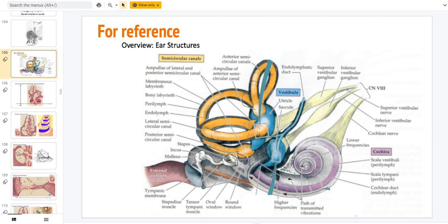This is a picture of the 3D structure of the inner ear and we're going to spend most of the time of this video looking at one particular virtual microscopy slide. I would spend most of the time on the cochlea since that's where most of the action happens, and we'll talk a little bit about the vestibular system as well.